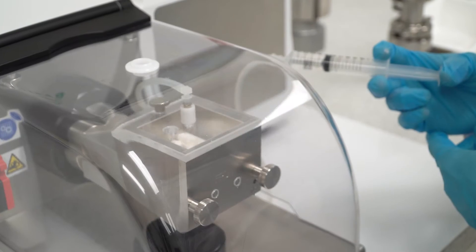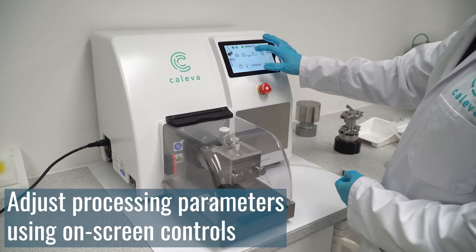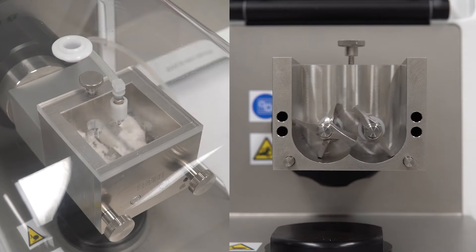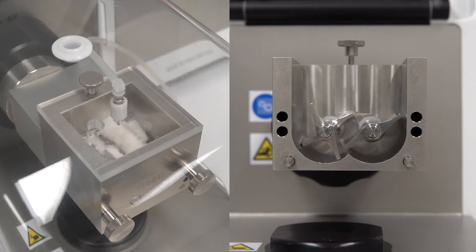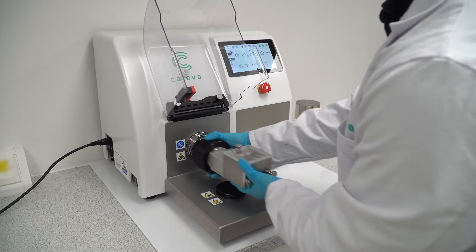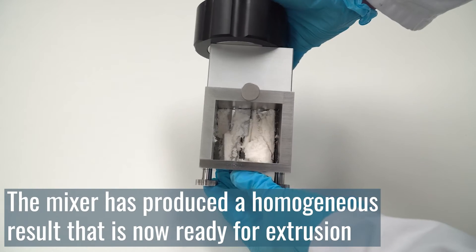Next, add the desired amount of liquid binder. Blade speed is adjustable by the operator using on-screen controls. Two counter-rotating blades operate at different speeds to provide a thorough mixing action. Once all liquid binder has been added and is adequately mixed, stop the mixer and remove your sample. The mixer has produced a homogenous result and the granulation is now ready for extrusion.